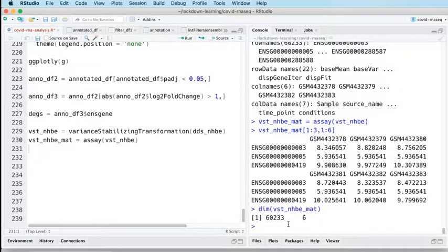So what we actually want to do is cut this down to just the differentially expressed genes. This matrix has row names, and the row names are the Ensembl gene IDs, so we can filter it using row names. If you want to filter on the basis of the row name, you can put Ensembl gene IDs in, a couple just by way of example.